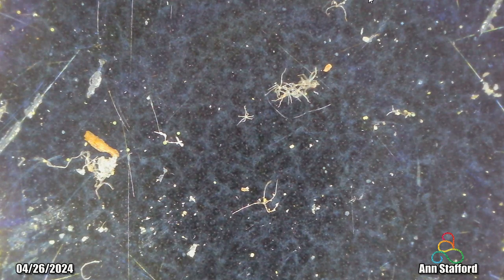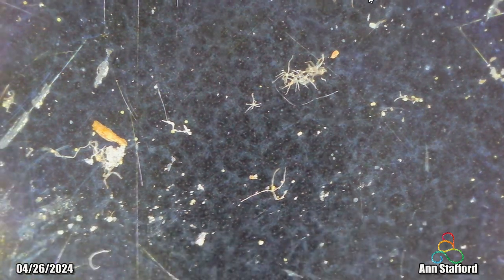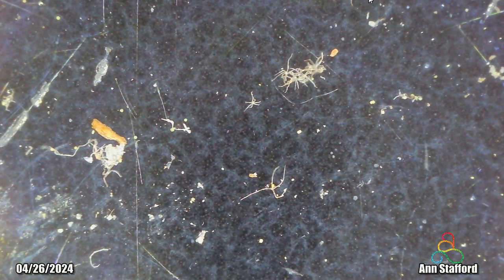And so today is the 26th, and what I've done is I let my tray, I use this black metal tray. Basically, anytime I have the microscope on, whatever I'm looking at is going to be sitting on that tray. I wash the tray off a lot with alcohol. Pretty much anytime I use it, I wipe it off and try to make sure there's not a lot of stuff on the tray. But after I saw these gnats with the hydras stuck to them, I decided to see just how many hydras there are floating around.